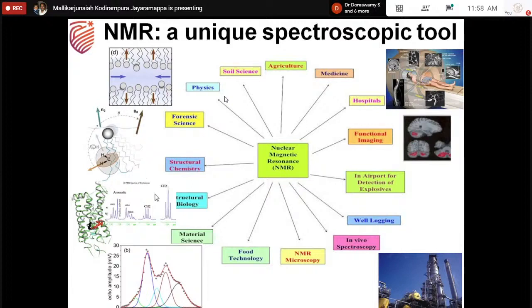These are conventional ways, and in my talk I am concentrating on the material science aspect of NMR: what the physics is, what the different motions are which can occur within the molecule, and what the time scales are occurring within the molecule. Those are my highlights, the fundamental properties I am discussing today. These three pictures, 1, 2, 3, are the concepts I am concentrating on right now.